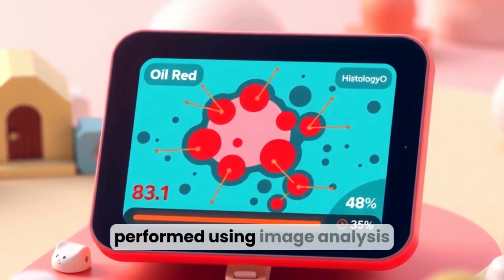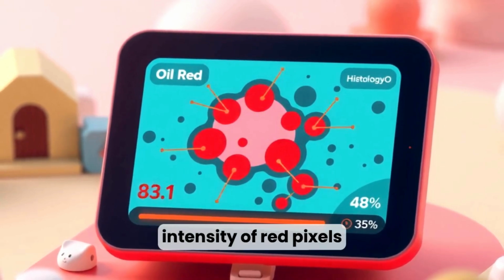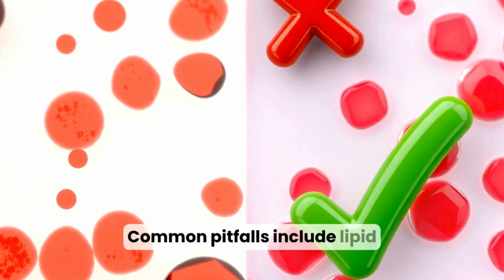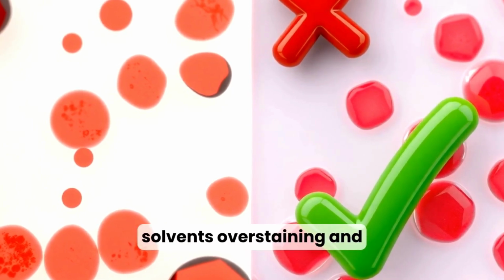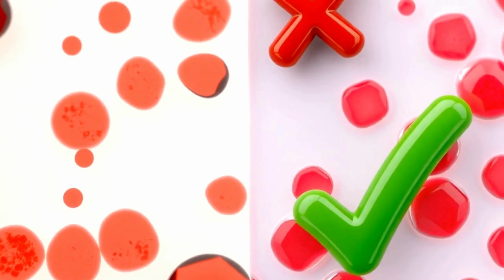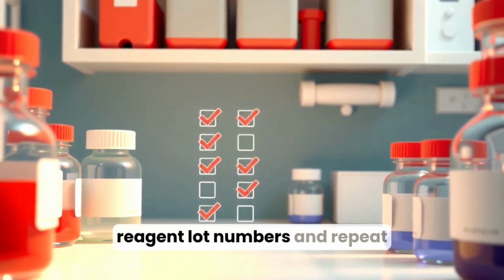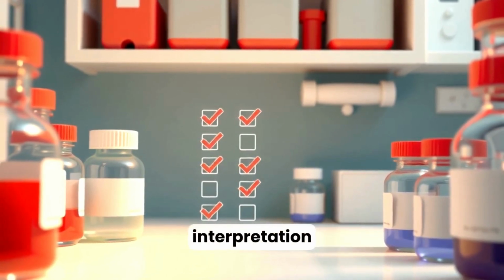Quantification can be performed using image analysis software to measure area or intensity of red pixels, normalized to total tissue area. Common pitfalls include lipid extraction by improper solvents, overstaining, and artifacts from frozen sectioning. Use controls and consistent technique to reduce errors. Always include positive and negative controls, record reagent lot numbers, and repeat staining if results are inconsistent for reliable interpretation.